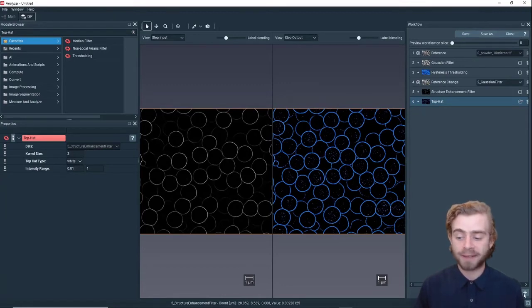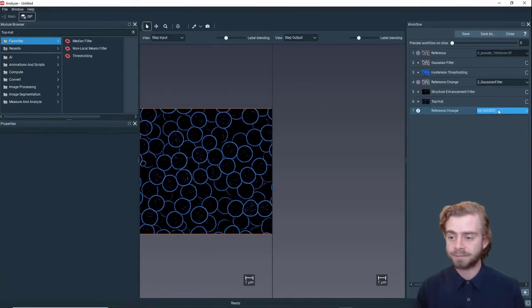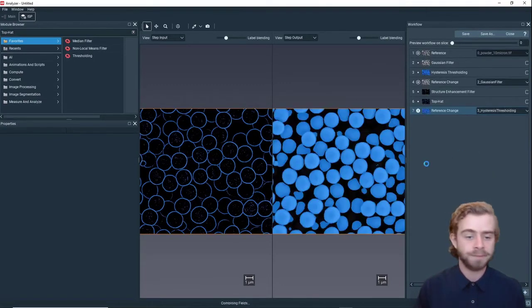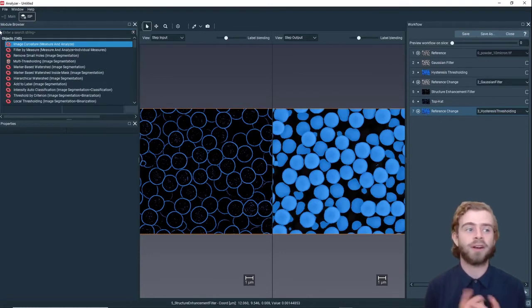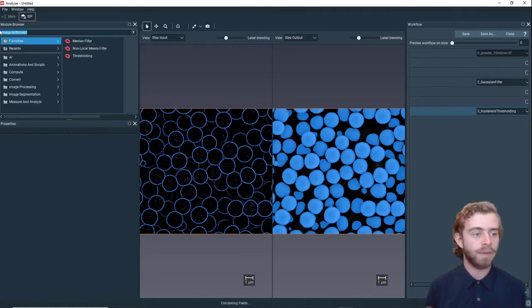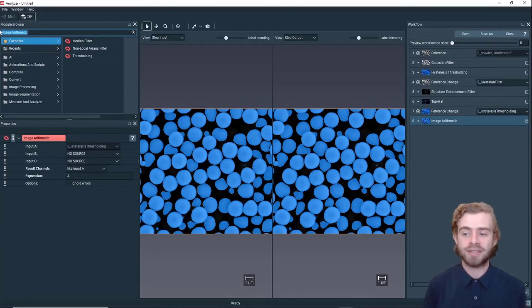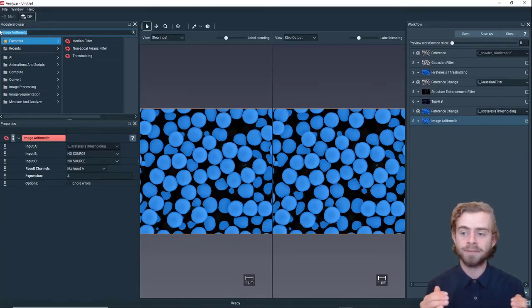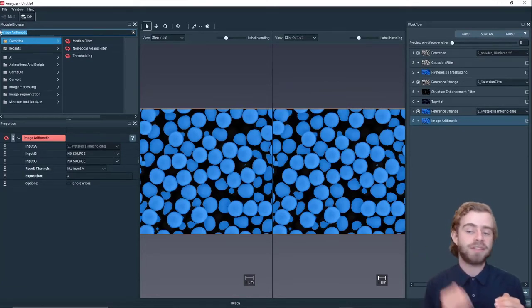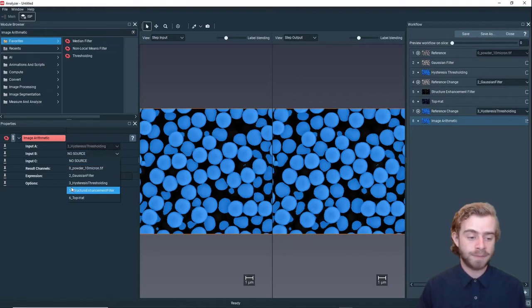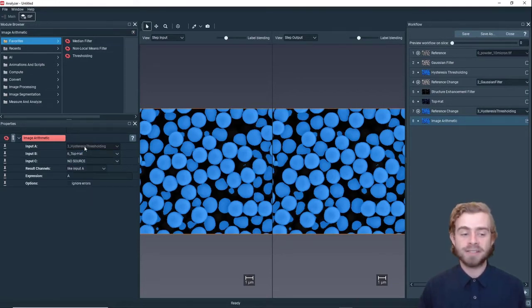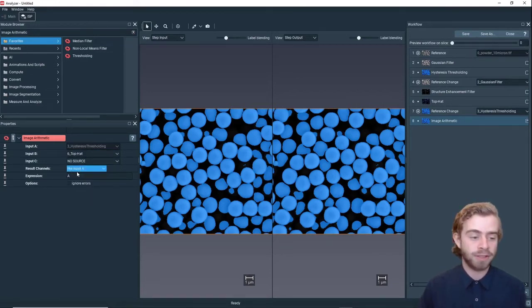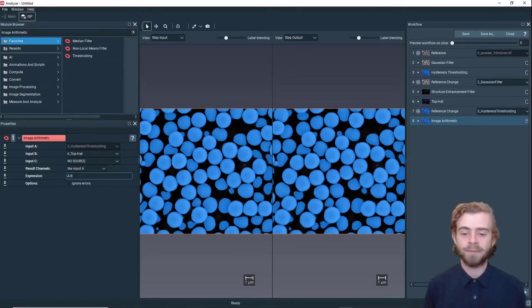Now that we have that, we're going to use another Reference Change step to go back to the Hysteresis Thresholding. Next we're going to create an Arithmetic module, which allows us to combine two images together. In our case we want to take the Hysteresis Thresholding output and subtract from it the Top Hat output. We'll select Input B to be the Top Hat, Input A is already set to the Hysteresis Thresholding, and we're going to do A minus B.